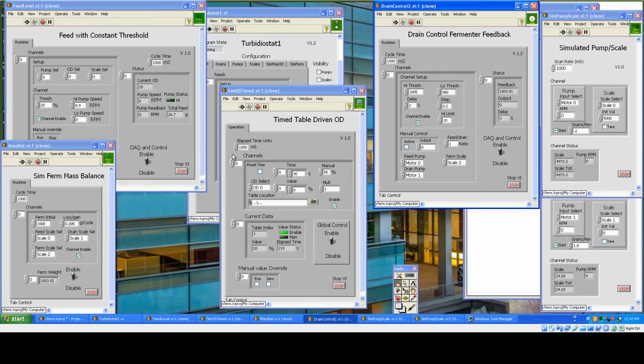Now the feed here is stopped because it's moved back down to 20 again. We're still within the thresholds here, so at this point this pump turns off because it follows the feed as an initial guess, and since we're within the high and low thresholds, there's no sense in changing anything. We notice this is slowly moving up again because of the constant gain that we're getting from down here.